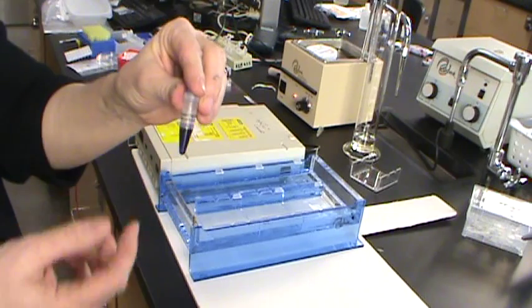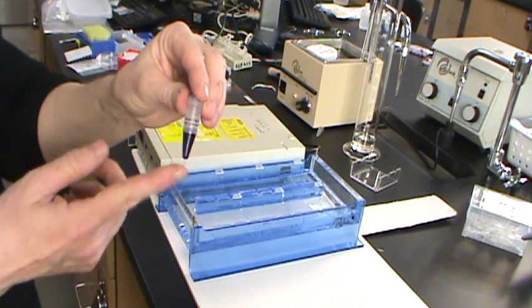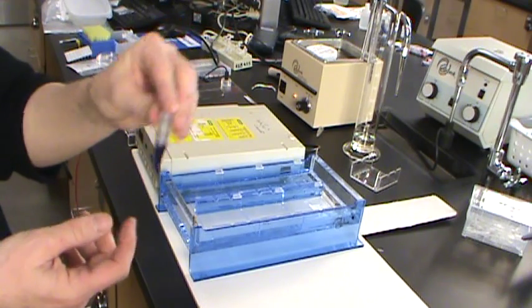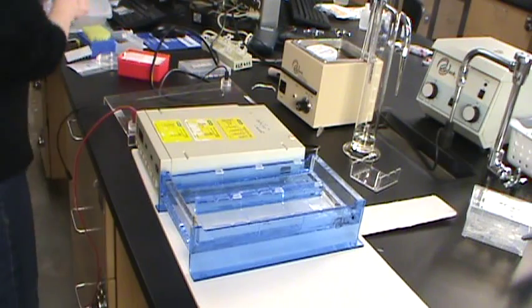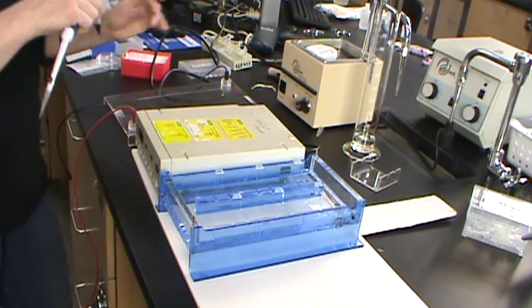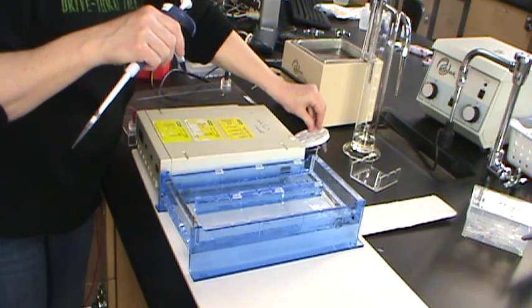And so we'll be able to monitor when our electrophoresis is completed when the dye front just about reaches the end of the electrophoresis gel. So when we have our reactions, we're going to add the required amount of our gel loading solution to that sample to stop the reaction.